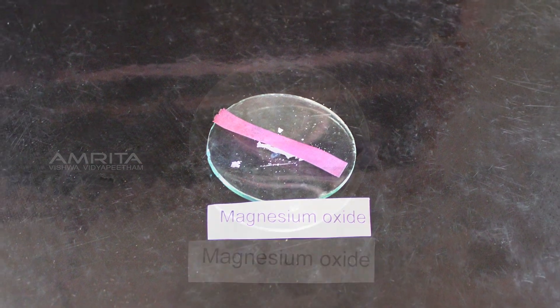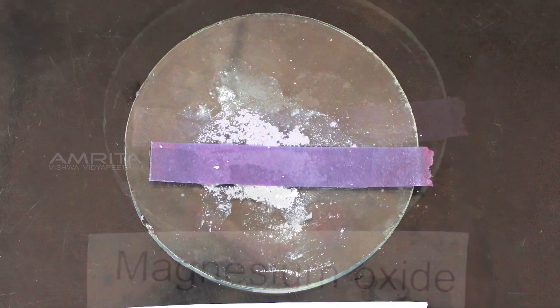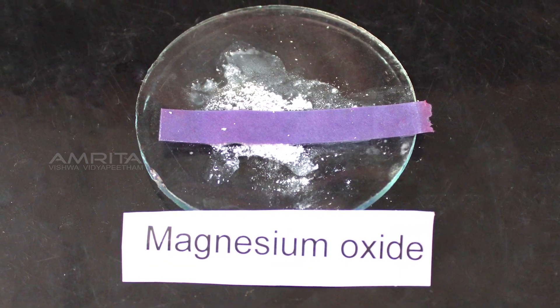You can now see that the red litmus turns blue. From this we can infer that magnesium oxide is basic in nature.